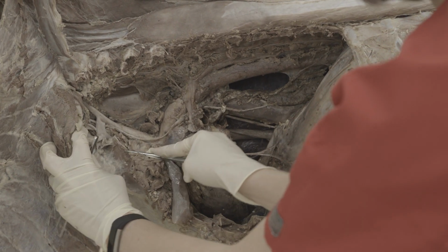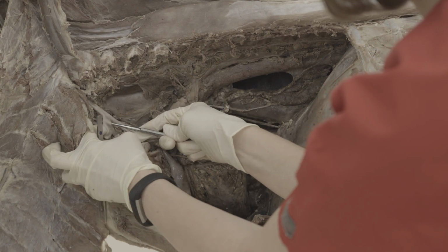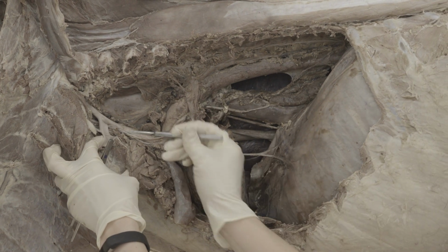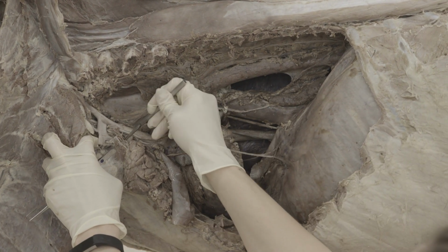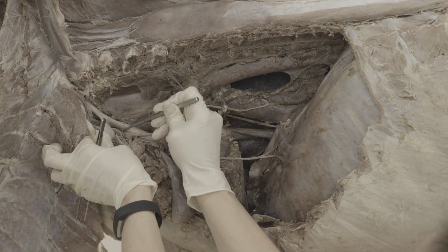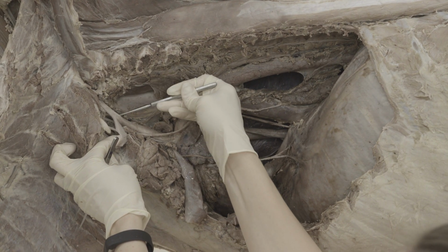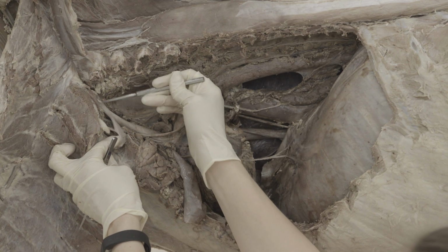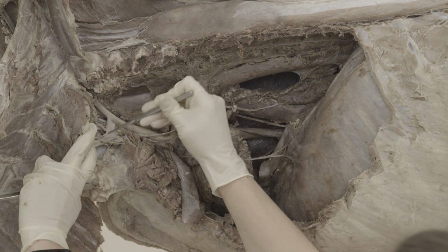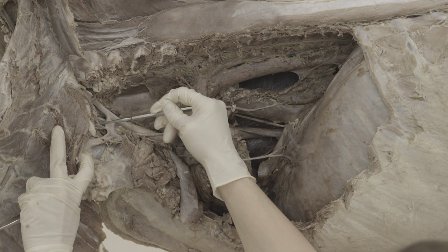So here, if I can maybe hold this out a little. They're a little bit harder to see. And so you have your internal thoracic, which will be going inside the chest here. You'll have your vertebral artery going up towards the back here. So vertebral. And you have a superficial cervical artery here.